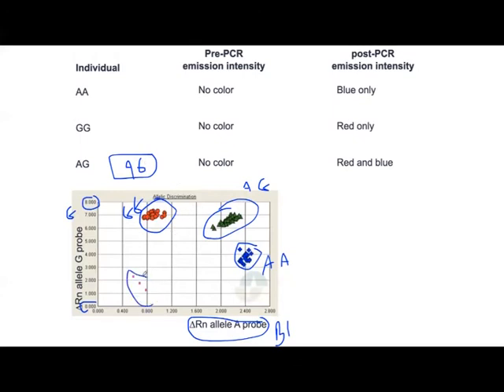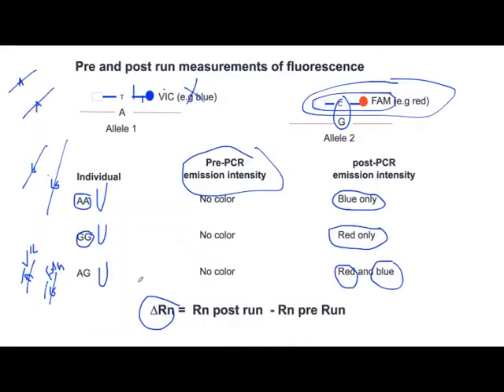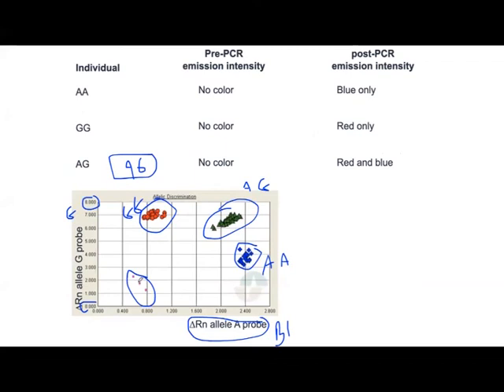These are actually the negative controls. So the samples without template should be very low. So whenever you wonder what these are, they are the negative controls. So that's basically one of the applications where we use probes.